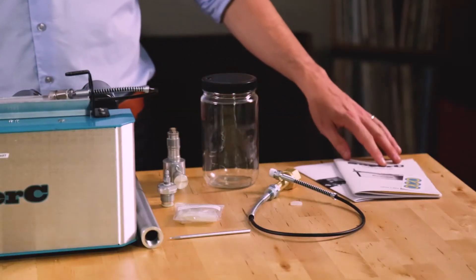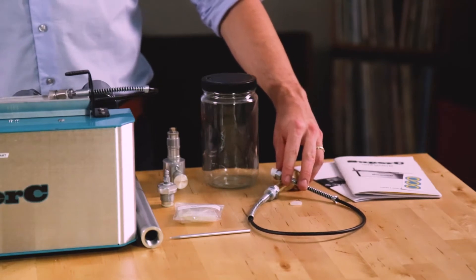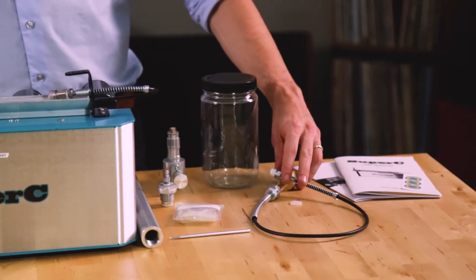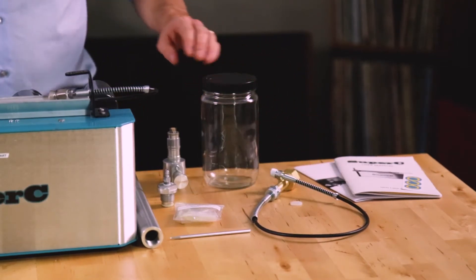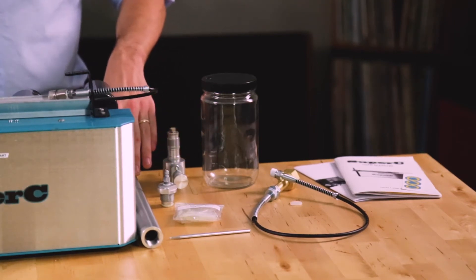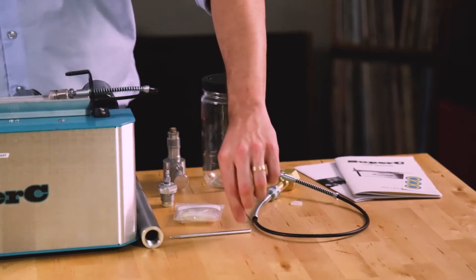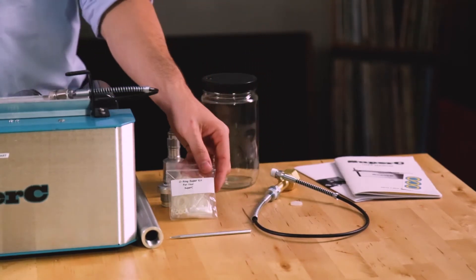You should receive a user's manual, assembly instructions, and a sticker. We'll also provide you with a tank feed hose for connecting the CO2 tank to your system. The collection vessel, vent valve, end cap, and chamber will also be included. For maintenance we provide you with an o-ring pick to remove the o-rings from the cylinder, as well as an o-ring super kit.